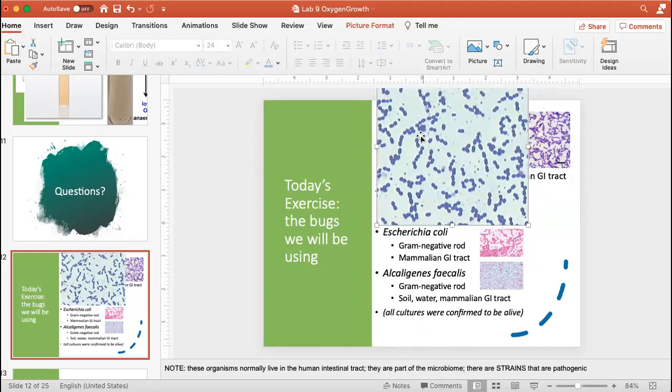If you look right here, for example, you can see two circles side by side, right? If I look over here, I also see two circular cells side by side. But then if you look in other places, like right here, they almost look like rods, don't they?